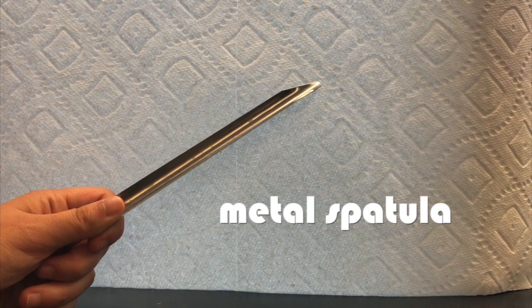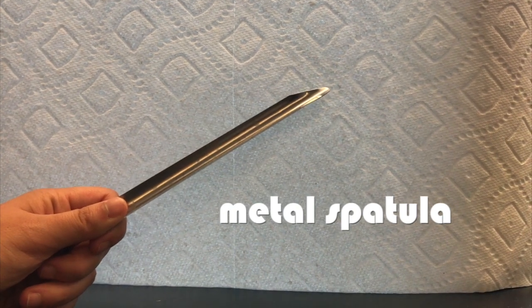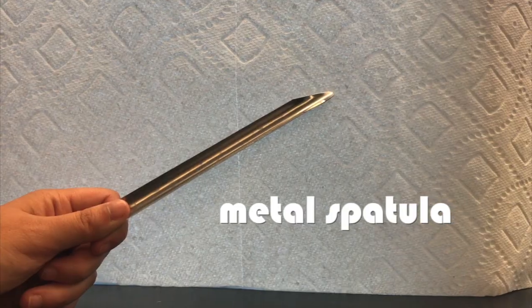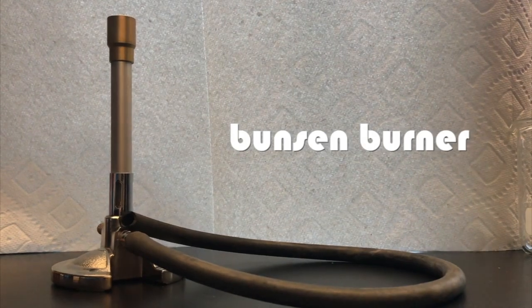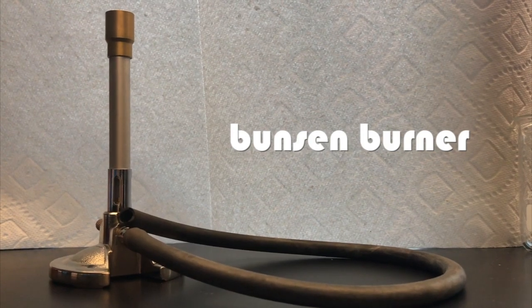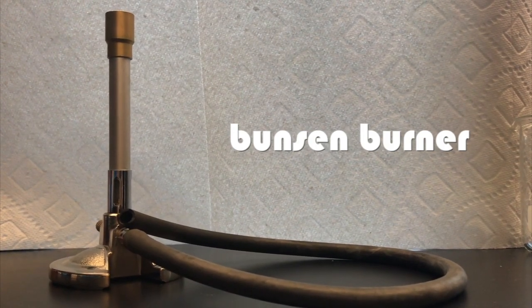This is the metal spatula. It is used to scoop and transport powders. This is the Bunsen burner. It is frequently used as a heat source in the absence of flammable materials.